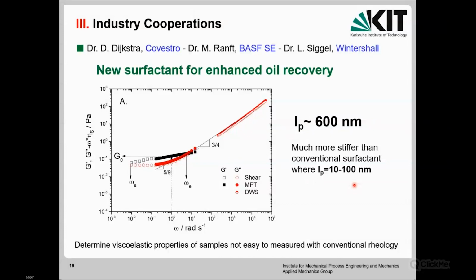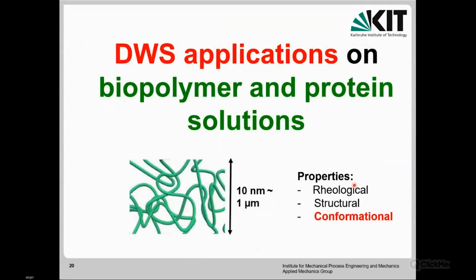So I would say DWS was quite successful for the investigation of worm-like micelles. The second application is on biopolymer and protein solutions. In that case also, we use DWS to get information about rheology, structural information, but here also conformational information.